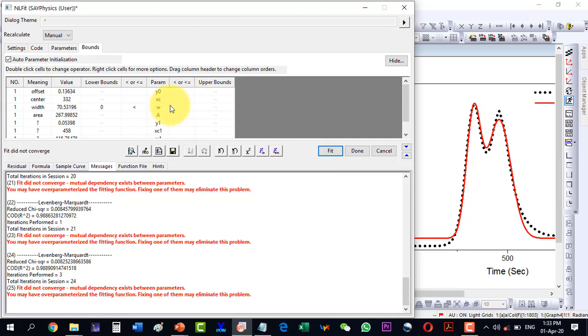You can define the parameters here, and if it is not going into two peaks, then you can make it go there by restricting the value at first and then releasing that value. So I hope much advanced things can be done in fitting. It will take a little bit of time, but it is not that difficult.